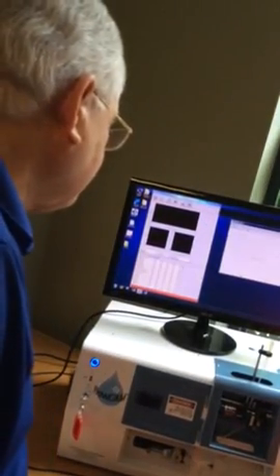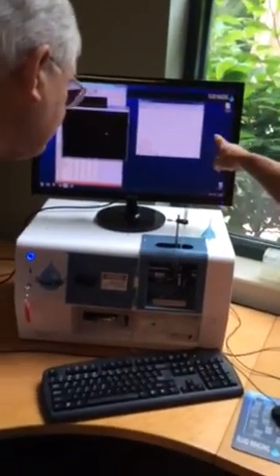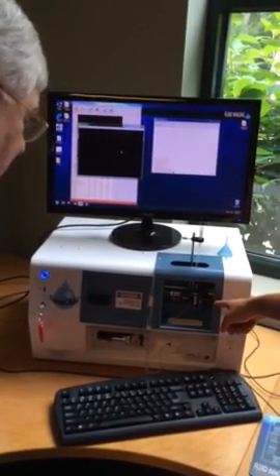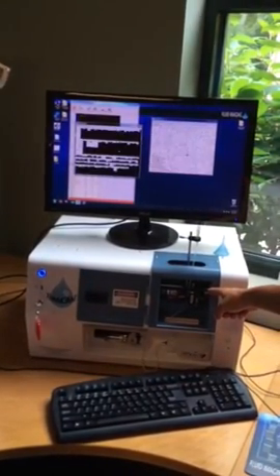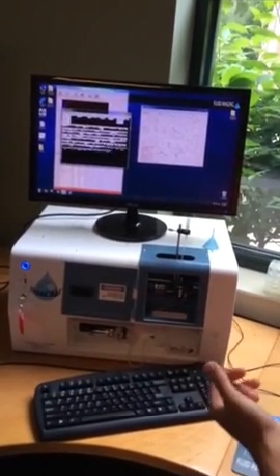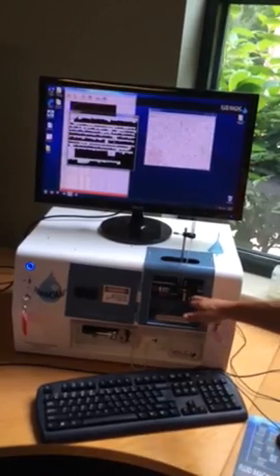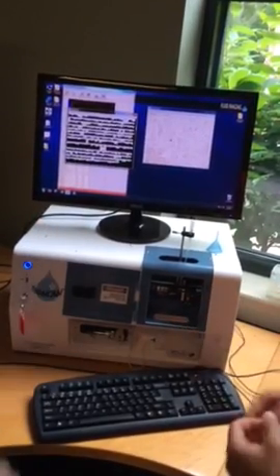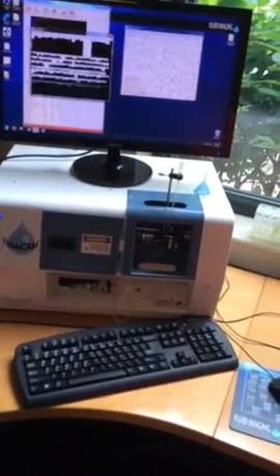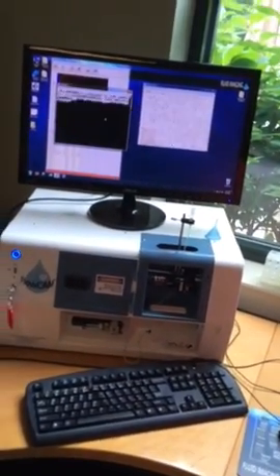In many cases, now, look what we've already done wrong. See how it's calibrated the background, but it's calibrated the background without any sample actually in there. And we don't have any particles, and then all of a sudden we have particles. So the first thing we did wrong was we didn't aspirate the sample and bring it into the sample area, into the flow cell. That means your first grouping is going to be nothing, so you can get rid of those.